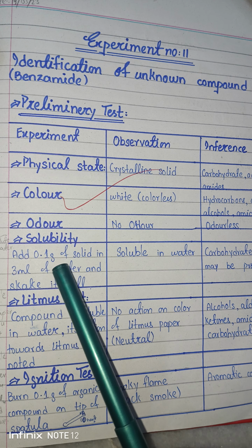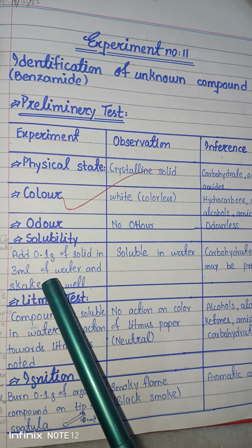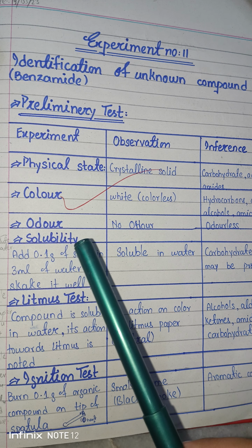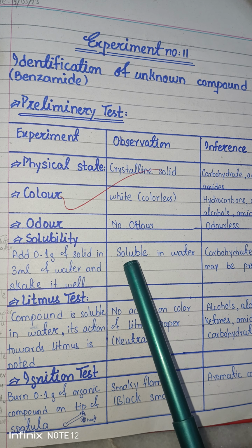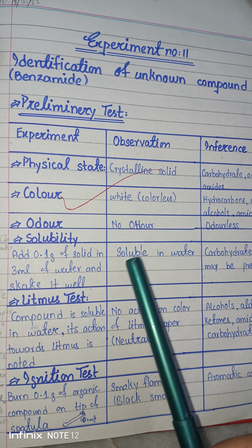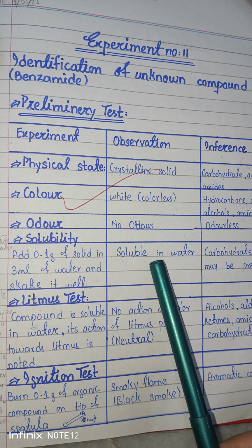Now you dissolve 0.1 gram of this solid in some amount of water, and then you shake it and observe whether it is soluble or not soluble in water. We see that the benzamide is soluble in water. Due to solubility in water, we say maybe a carbohydrate or an acid could be present.